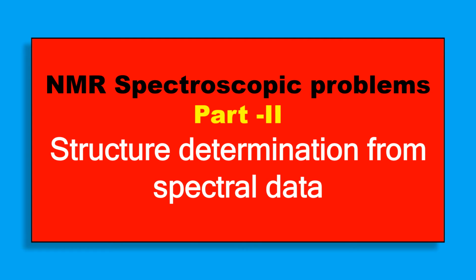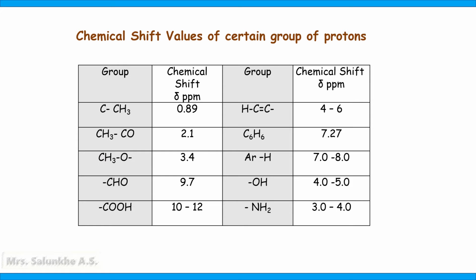Welcome everyone to part two of NMR spectroscopic problems. In this video, we are going to learn structure determination of organic compounds by using PMR spectral data. Before going to problems, we are going to see some important things.